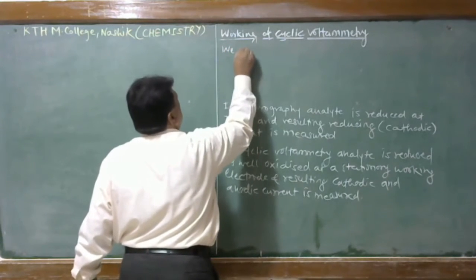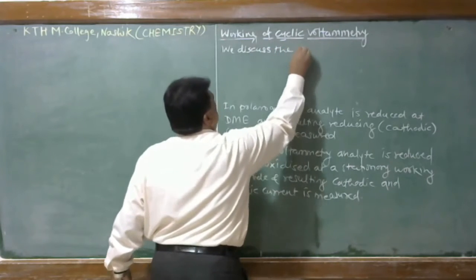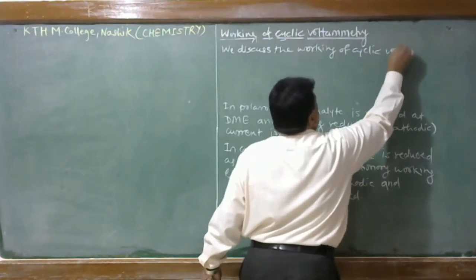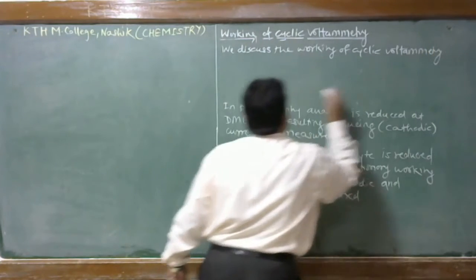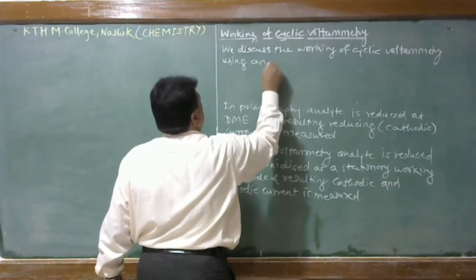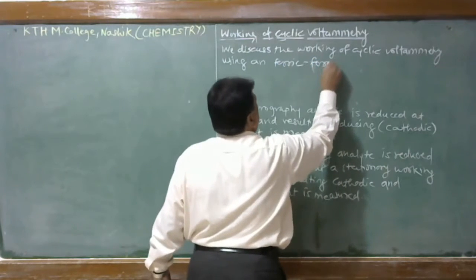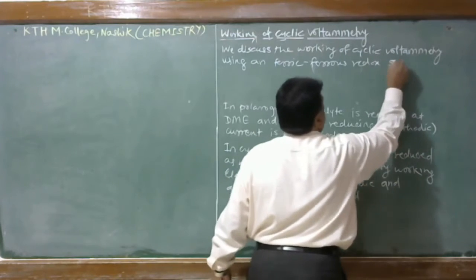We discuss the working of cyclic voltammetry using ferric-ferrous redox system.